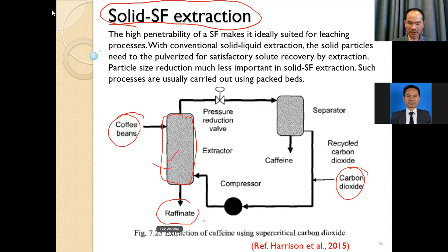the coffee. And also for this case, at the top we get the separated caffeine. The caffeine will separate and flow out together with the supercritical carbon dioxide.